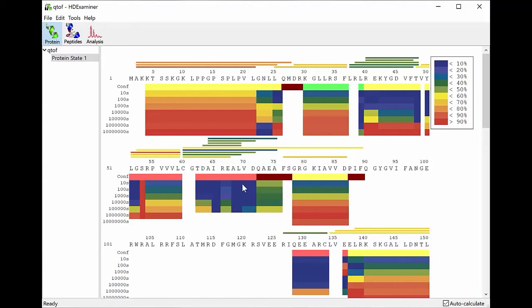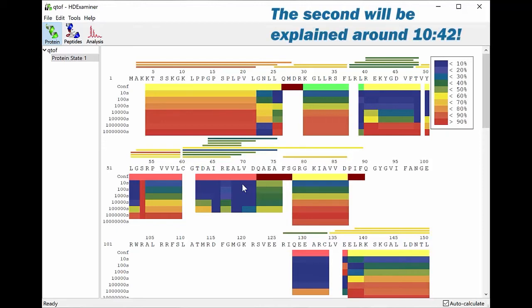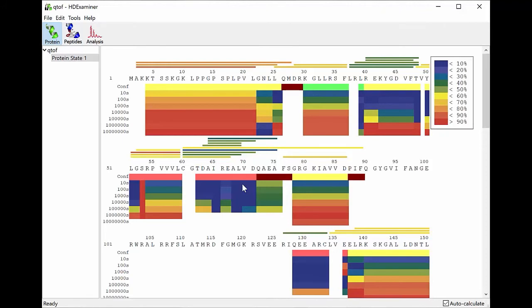Now, when you're doing this kind of big least squares linear algebra problem, there are two potential issues that can trip you up. The first is when your peptides don't tell a unified story, specifically when your peptides don't agree with each other very well. Since we're all scientists, we know what a scatter plot with a trend line looks like.